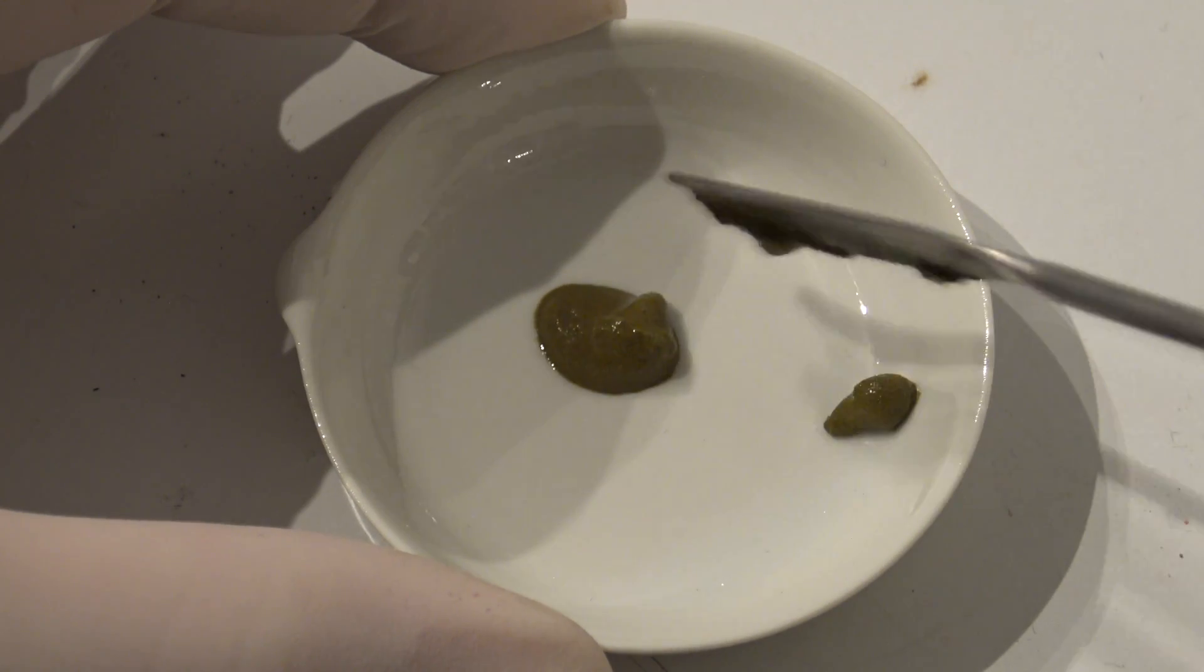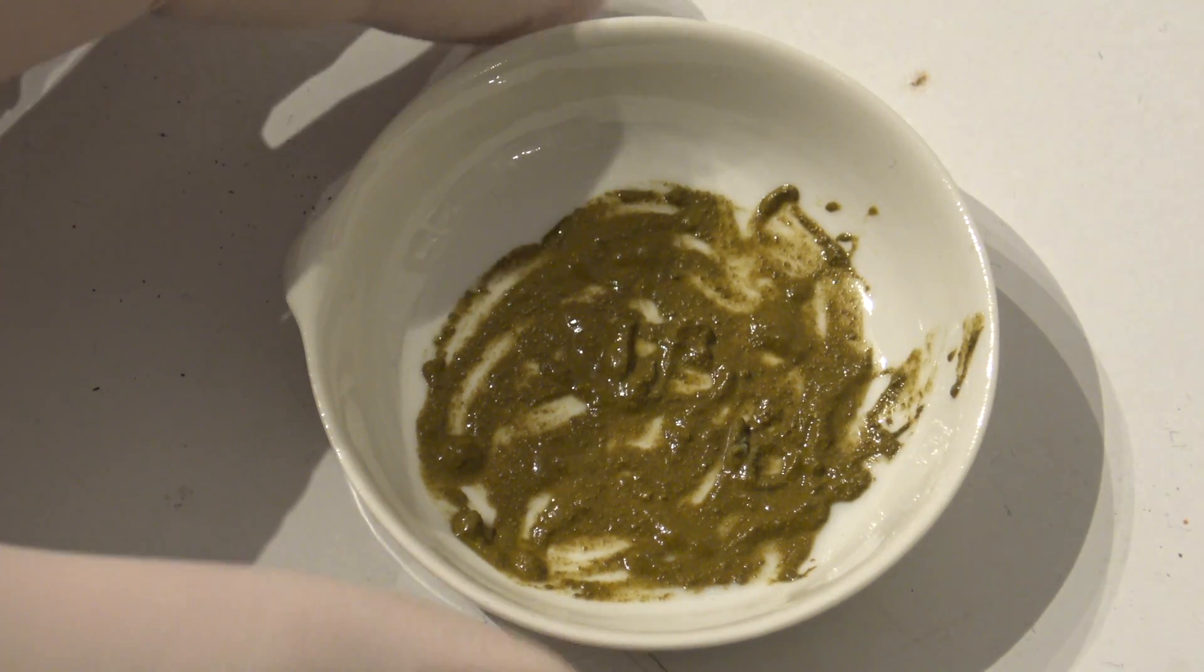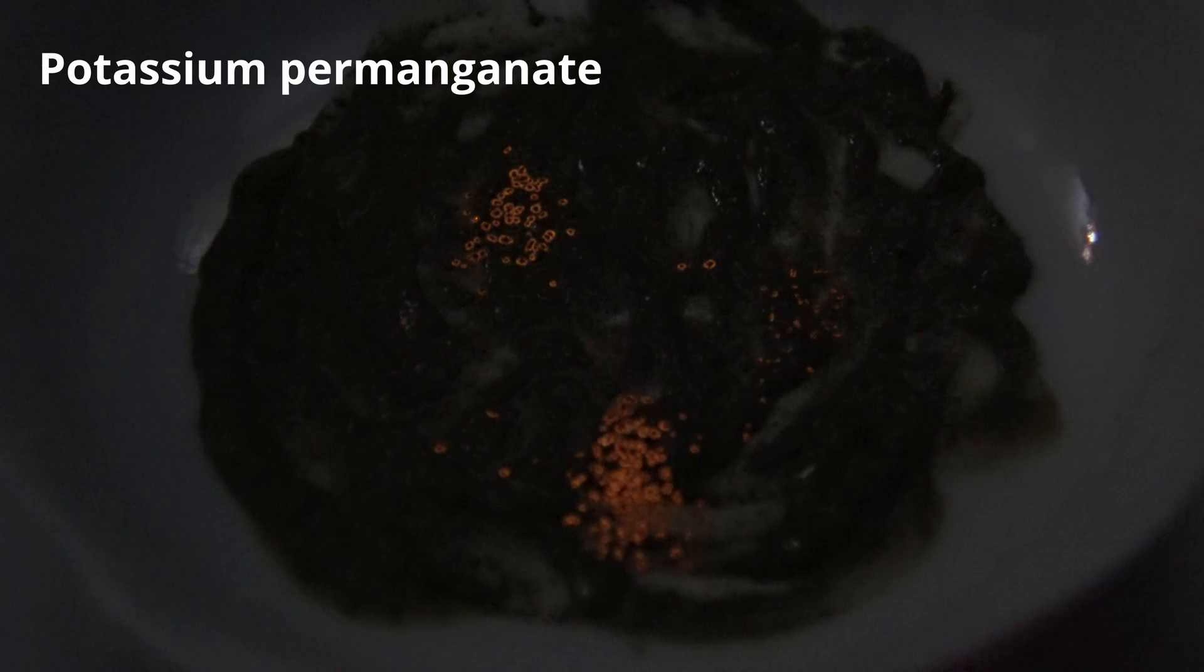First, some were spread out in a porcelain dish. Then the lights were turned off and potassium permanganate was carefully sprinkled over the siloxene, which still had traces of acid on it. An orange chemiluminescence can be observed.